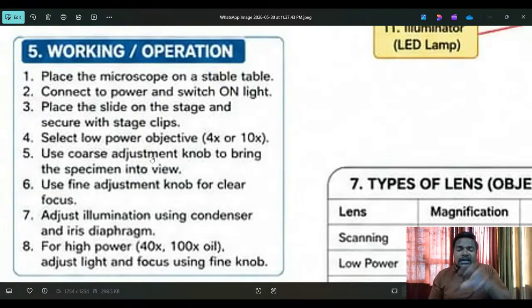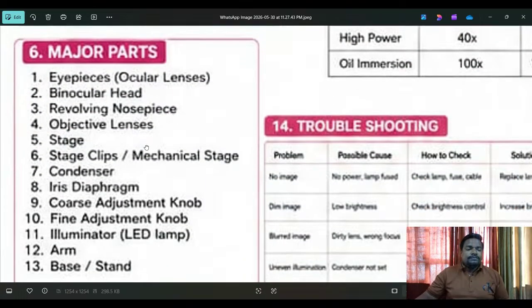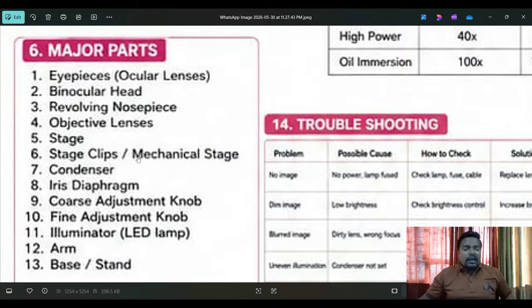That's why, through my live session, don't give the chance to other people and don't let them neglect our services. Okay, right? This is the working operation. I hope you got it. Now I will go to the main point. See what points, how to focus.